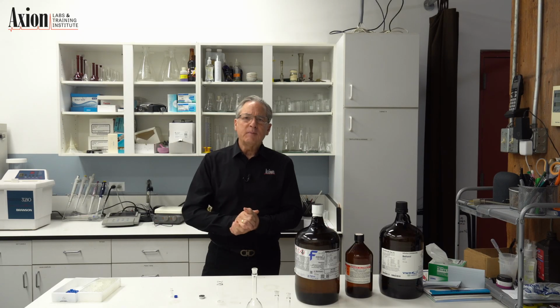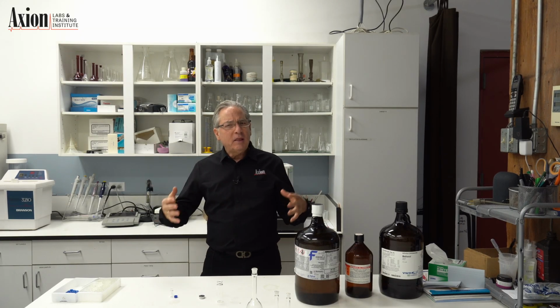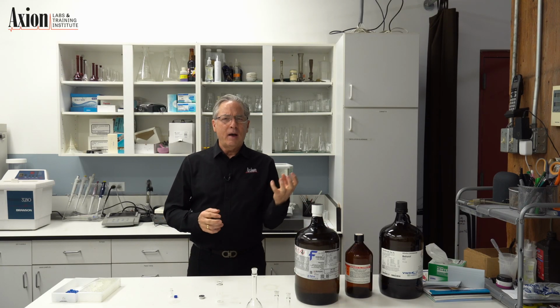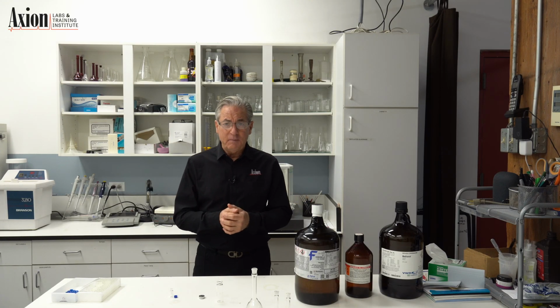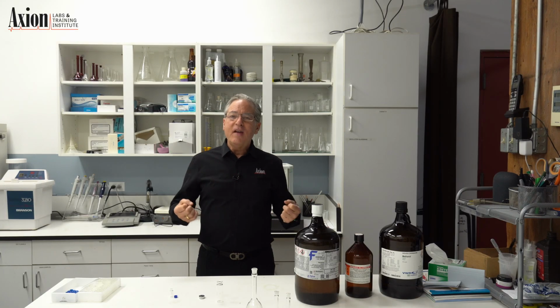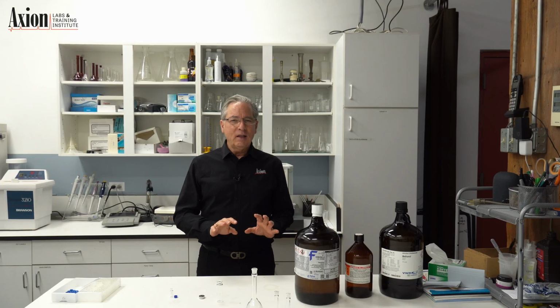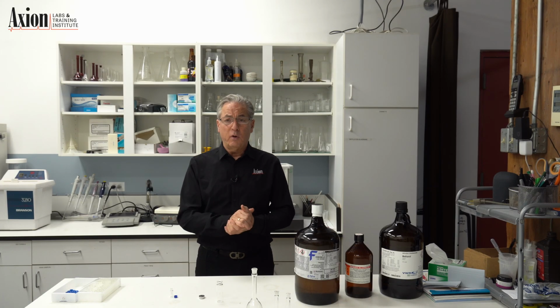So one of the important things about GC is how do we get the sample into the GC? Now we've had a look at the flow paths and everything else, but now we need to talk about how do I get my raw, neat sample in a form that is acceptable to the GC. So the big deal in the GC world is that the sample must be volatile. You've got to vaporize it. Anything that does not vaporize, you leave behind in the inlet. So ideally, we want to get a sample that's 100% volatile. That is the ideal situation for GC.